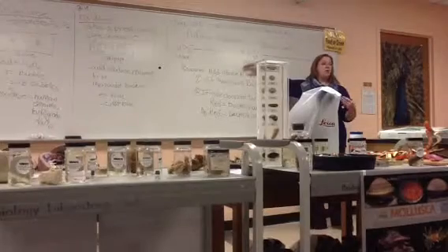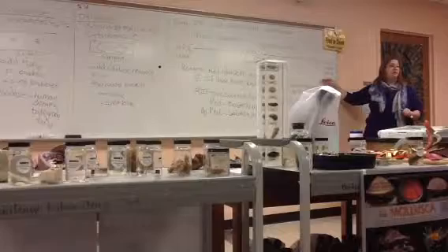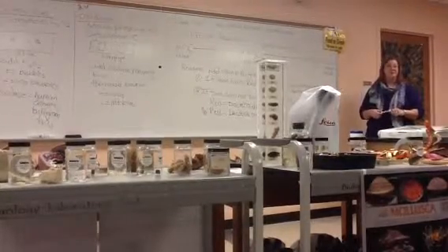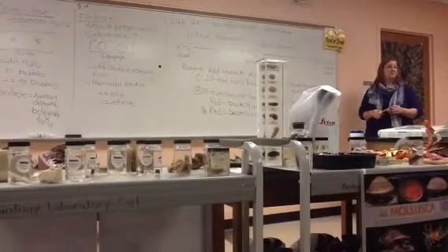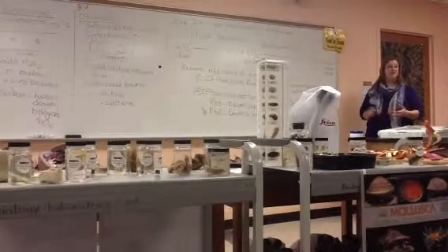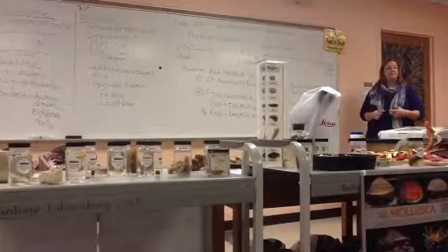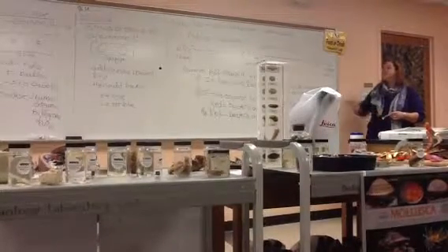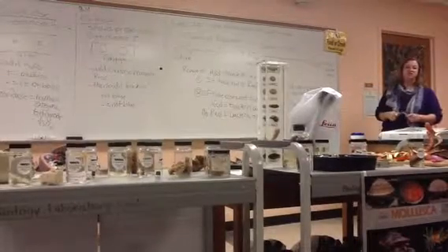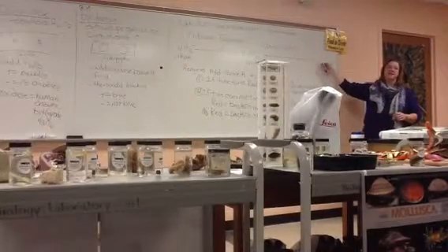Some bacteria can do both nitrate respiration and denitrification and end up all the way over here. And then there are some bacteria that can't do either one. So we've got three possibilities here. Bacteria can do nitrate respiration but not denitrification. Bacteria can do both, or bacteria can do neither. And the last, the end one right there, that's nitrous oxide. And nitrogen, that little G is gas.